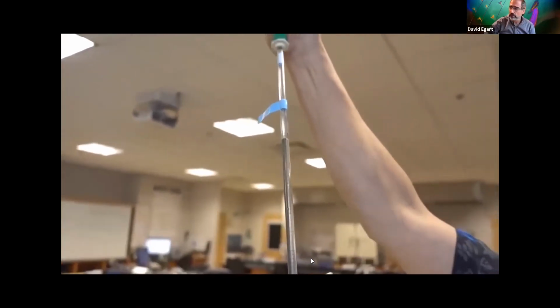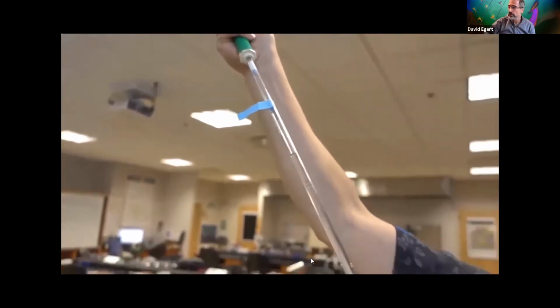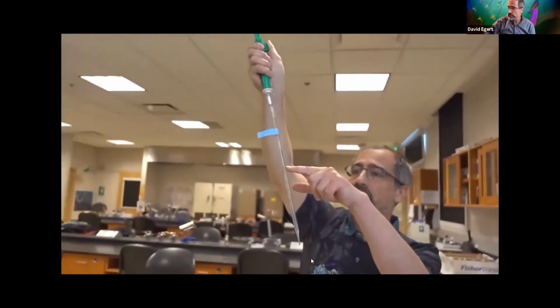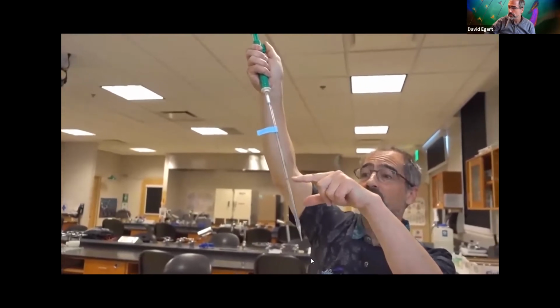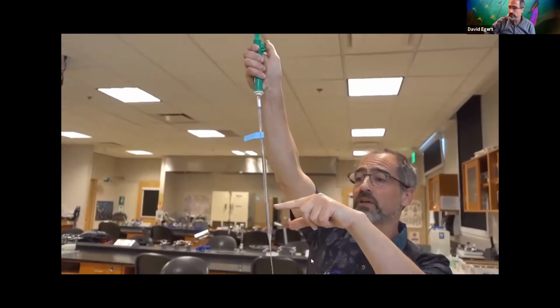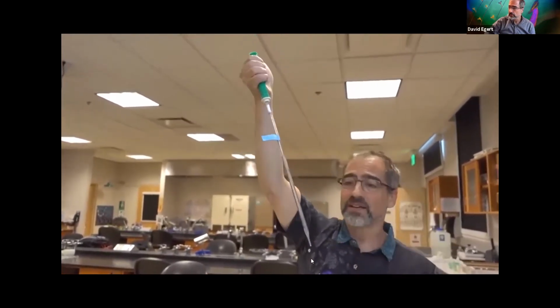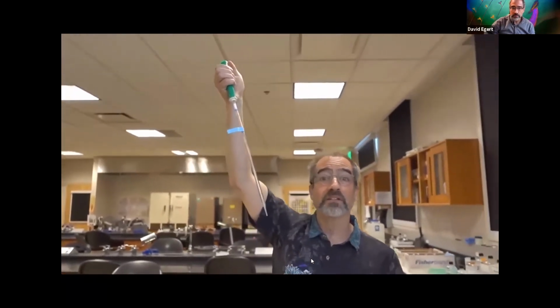When I squirt water out, so this is just water, so this is actually safe, it goes down to the 1. That means I have just dispensed 1 mil. I've now dispensed 2 mils, and I'm down to the 2. I've now dispensed 3 mils, I'm down to a 3. I got it all out, I have just dispensed all 5 mils.